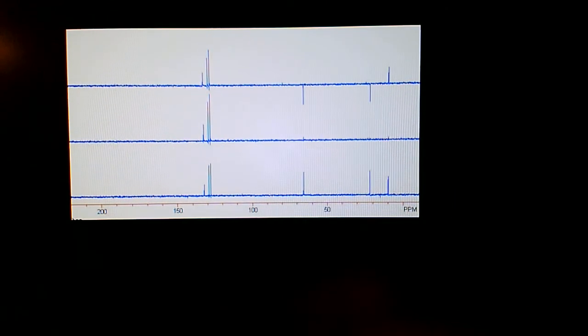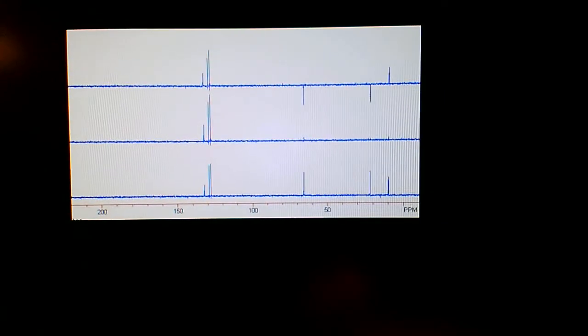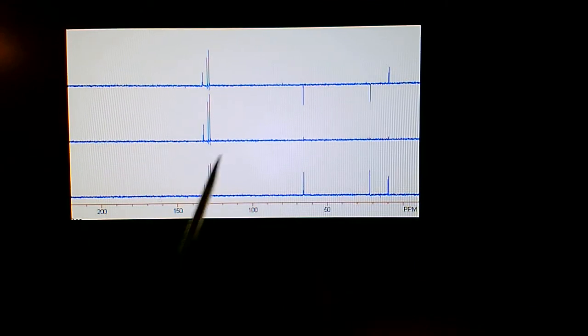Of course, chemical shifts do apply because this is carbon-13. DEPT spectra are carbon-13. So the chemical shifts right here at about 130 ppm tells me this is probably aromatic. These carbons are probably part of a benzene ring, a phenyl ring. This one peak right here is about 65 or so. Well, what pulls a carbon down to a chemical shift of 65? Being bonded to an oxygen. I'm betting this carbon, which is a CH2, is bonded to an oxygen. And these are saturated alkane peaks.